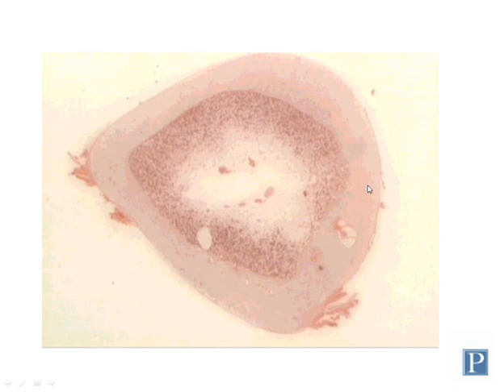Okay, and so what you can see with this low magnification view of the bone, you have the outer part of the bone, which is composed of compact bone, and then you have the inner marrow cavity, which consists of blood, hemopoietic stem cells, adipose tissue, and some other cell types.